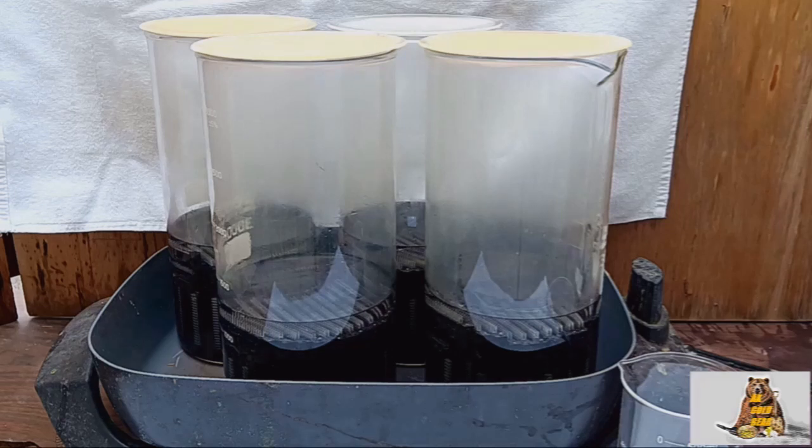I have four beakers. Now let's talk about a very important part: there is some kind of silicone or oil on the plastic, and it's very important to remove this oil before dissolving the metal in aqua regia. Very important.